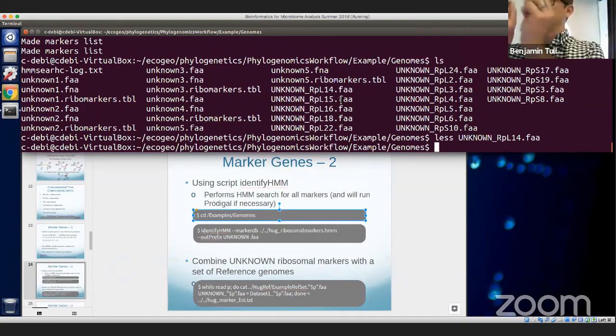What we're essentially going to do is write a little bit of code where Unix is going to run in a way that'll give us a bunch of results, read in something, and then output based off of what it's read in. So we're going to say while read P, where we define what P is. We're going to ask it to do something, so we're going to put a semicolon here. And we're literally going to say do.